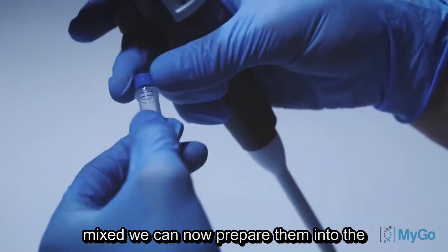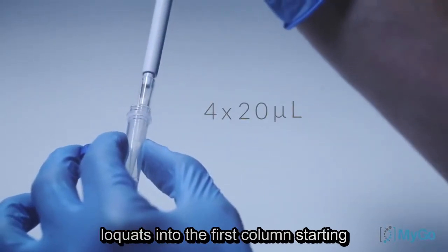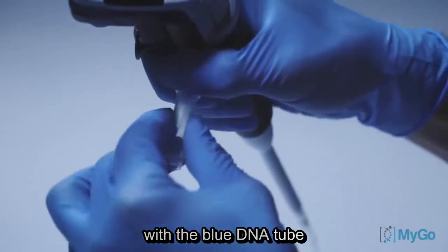Once mixed, we can now pipette them into the strips. Pipette four 20 microliter aliquots into the first column, starting with the blue DNA tube.